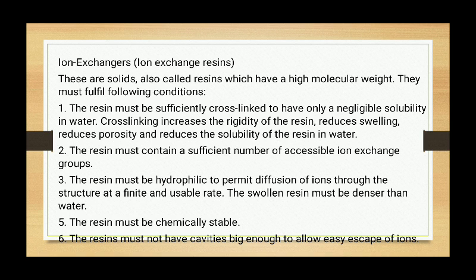The resin must contain a sufficient number of accessible ion exchange groups. The resin must be hydrophilic to permit diffusion of ions through the structure at a finite and usable rate. The swollen resin must be denser than water. The resin must be chemically stable. Also, the resin must not have cavities big enough to allow easy escape of ions.